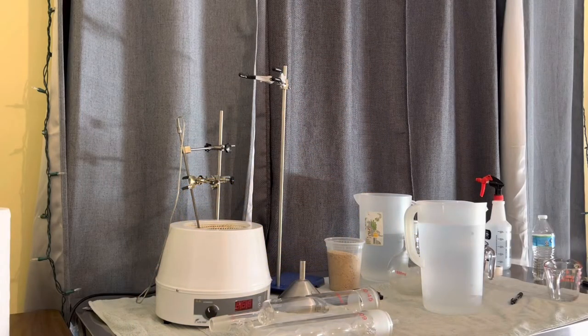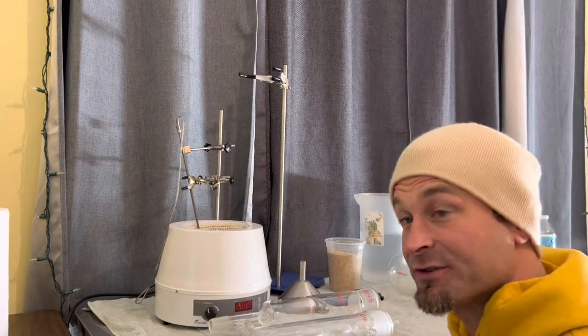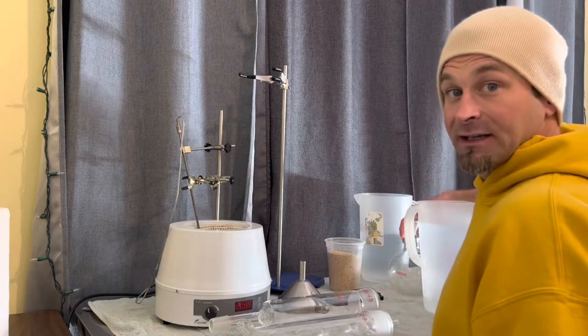Good morning. My name is Eric Fisher from Agape Mycology, and today I'm going to show you mushroom extraction using a Soxhlet apparatus. All right, so first things first, let's build her.